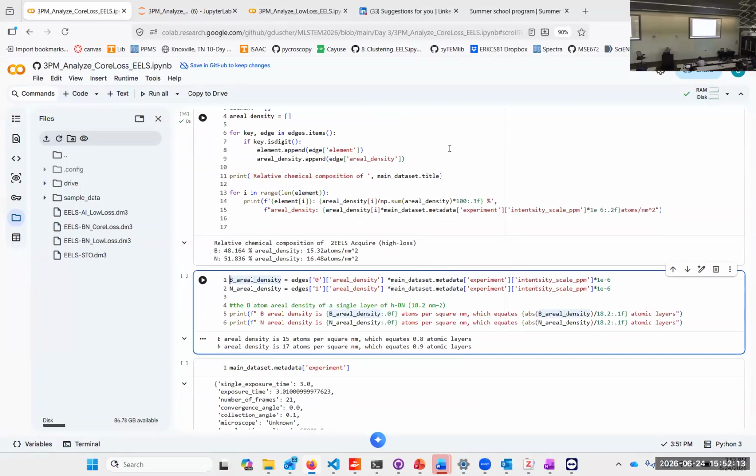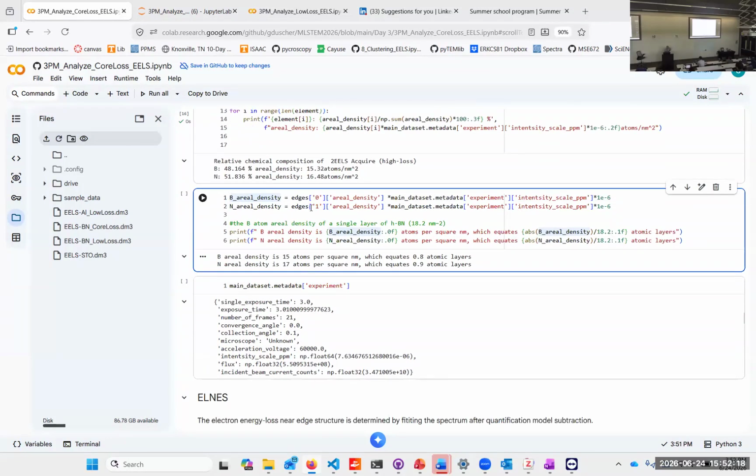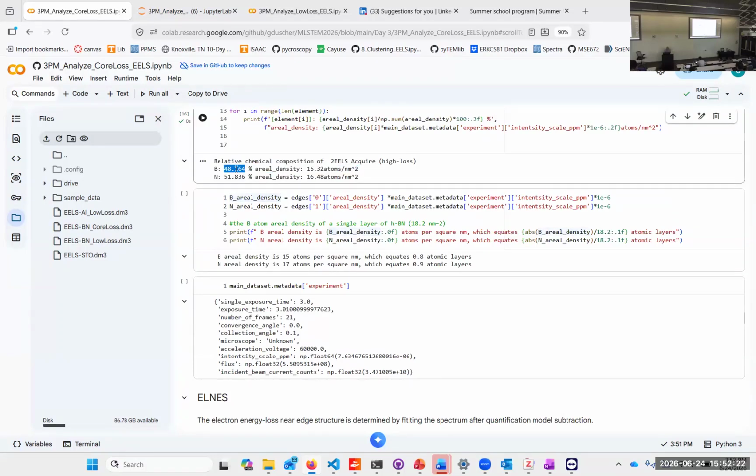And we have a relative intensity of 48 to 51. So we are about 2% off in our relative intensity. The reason is the relative intensity depends strongly, of course, on your noise.